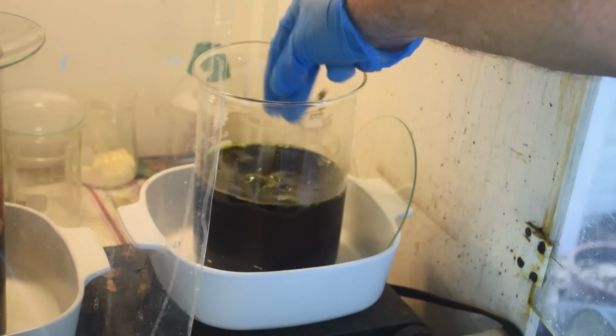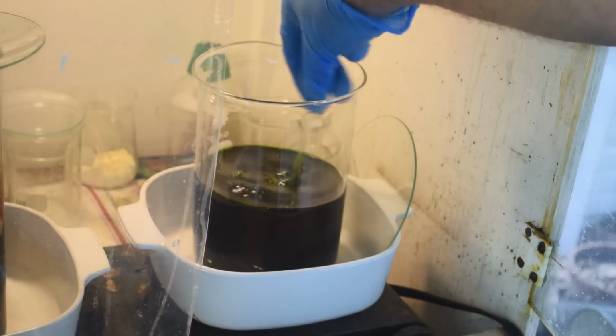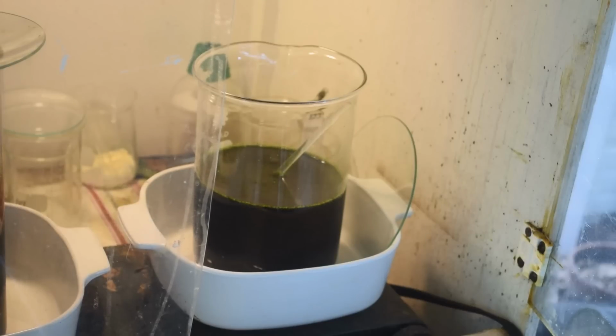This liquid's a little more dilute than the first stuff I've done, so it may not have as strong a reaction with the sodium chlorate. Yeah, definitely not having a stronger reaction with it. Oh, wait a minute, wait a minute. Yeah, you see, you've got a bit of a delayed reaction going on here. Yeah, there it goes. Don't ever trust that sodium chlorate in there. Sooner or later, something's going to happen.